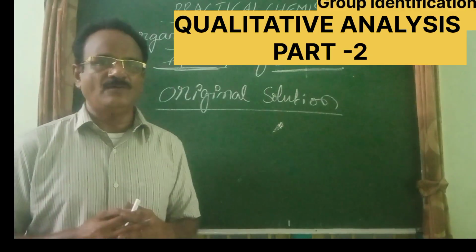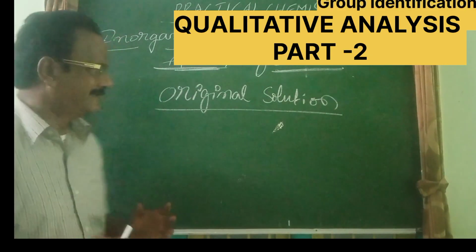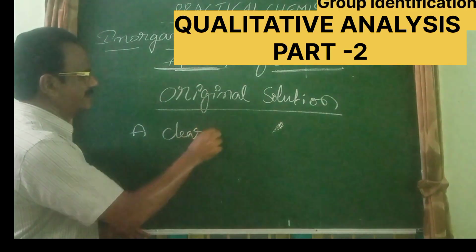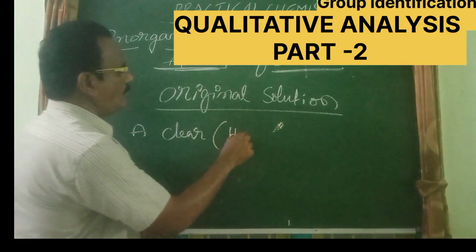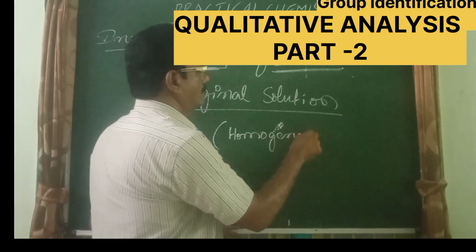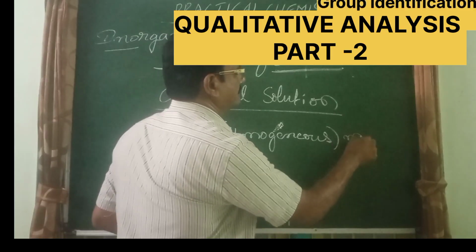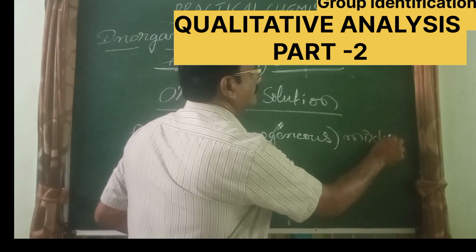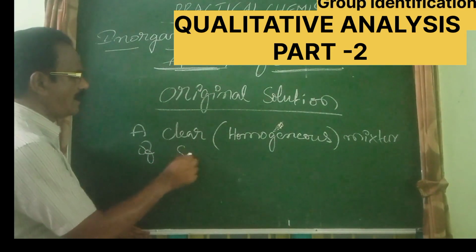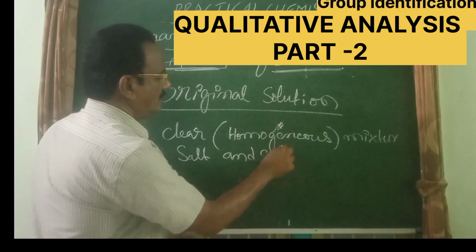Now let us see what an original solution is. It is very simple. It is a clear or homogeneous mixture of salt and solvent.